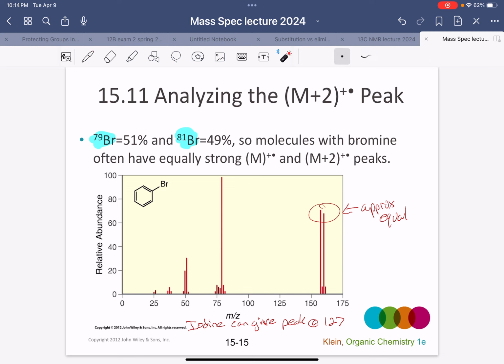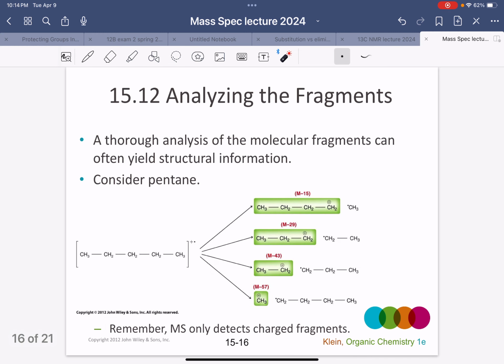All right. So, if you don't get anything else from the mass spec lecture, just remember that about the halogens, and it allows you to identify what halogen you have very easily. Now, the other thing it's useful for is fragmentation. So sometimes students have alkanes as their unknowns, and those can be a little tricky to deal with. If you had a mass spec, then you could actually use a fragmentation pattern to kind of piece things back together. So take a look at pentane, for example.